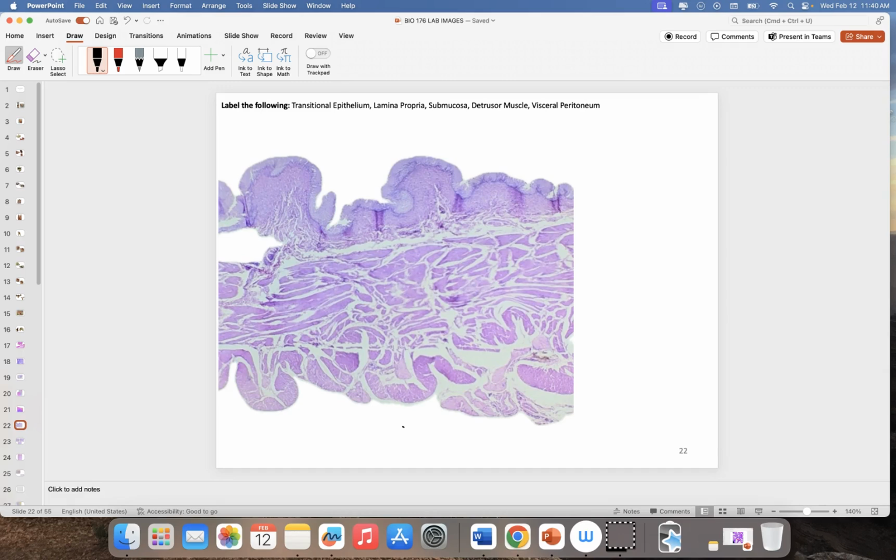In this case, we're going to be facing an internal space, that internal space in the urinary bladder that's going to temporarily store urine. So that's what we have here. If we can envision, this is the space where we temporarily would hold urine, and this then is the apical surface, making this our transitional epithelium.